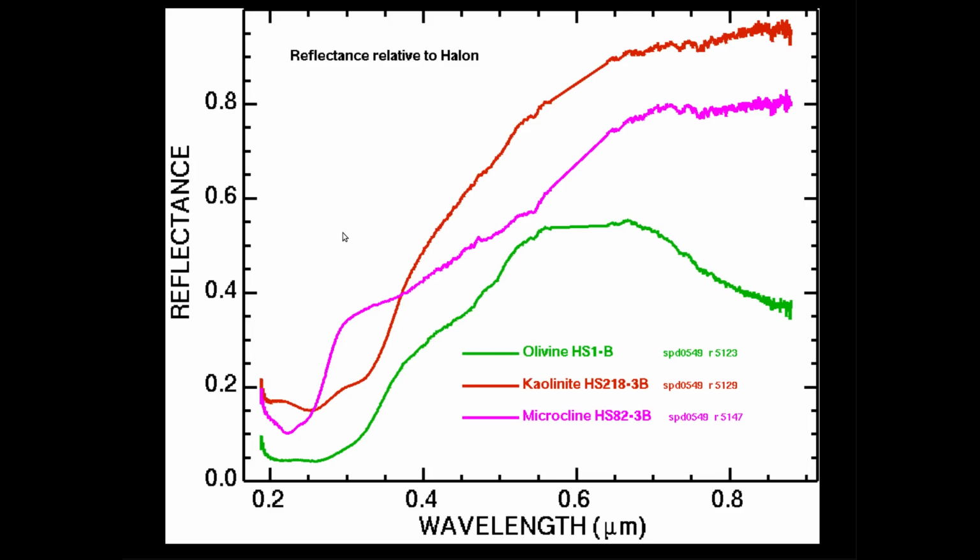Again, more spectral features in the UV, and how do we command the expert system? For example, a continuum from here to here would show this spectral feature at 0.32 microns. And is that a unique identification of kaolinite? I don't know.